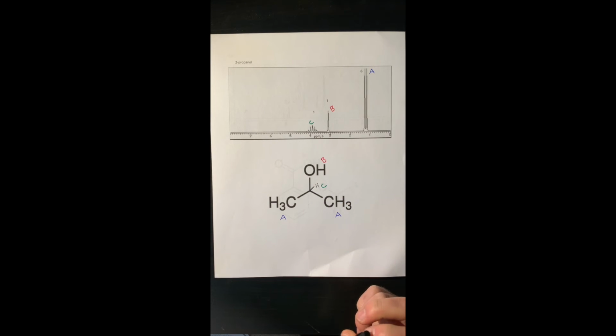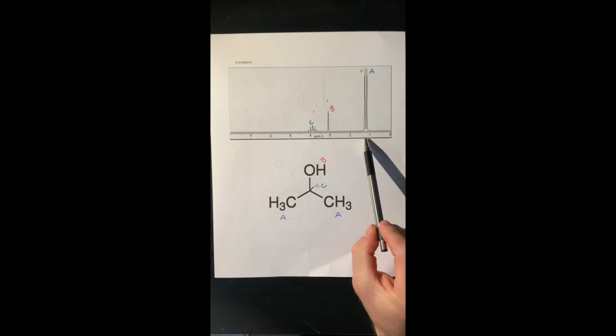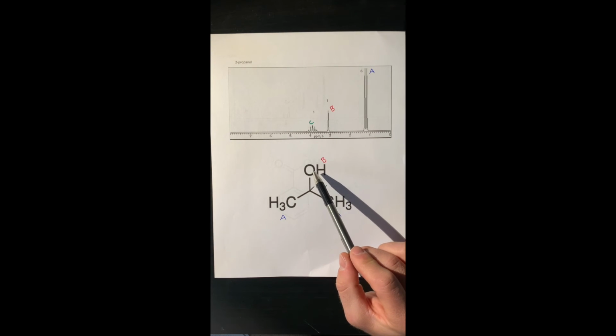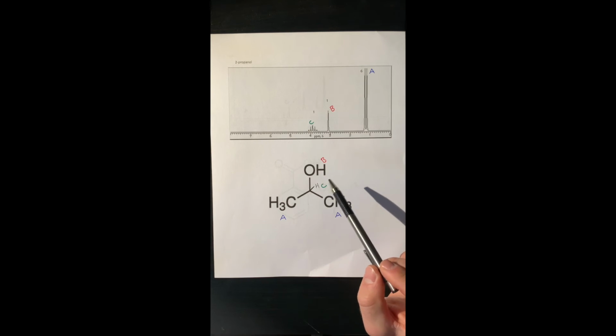So the placement of these signals are so far downfield compared to the doublet here just above 1 ppm because, as we know, it's attached to an electronegative oxygen, and that pulls the signal further downfield. So now we'll look at a little bit more complex molecule here called aspirin. It's the final NMR that we're going to look at in this video. So I hope you guys are starting to understand it a little bit better now.